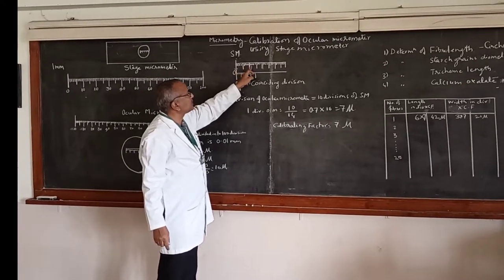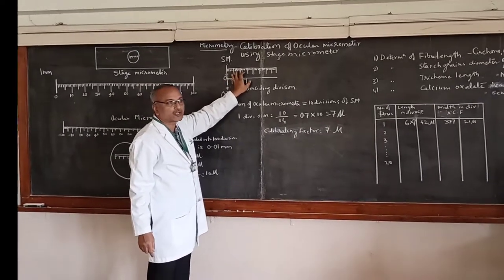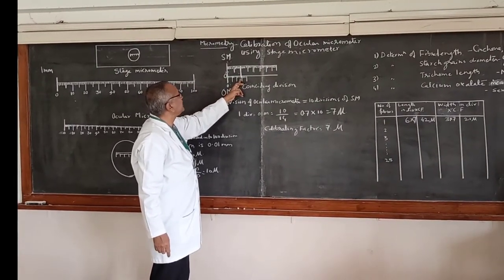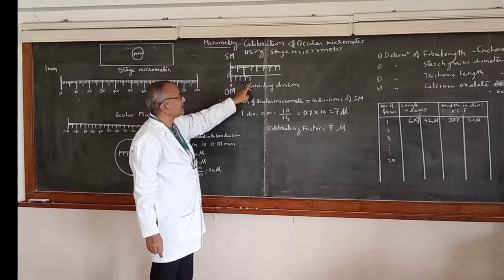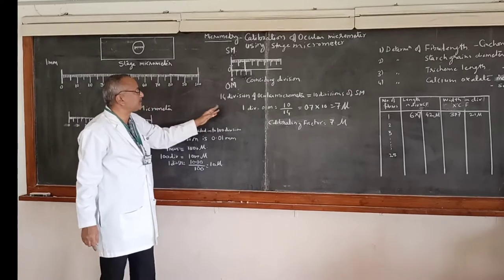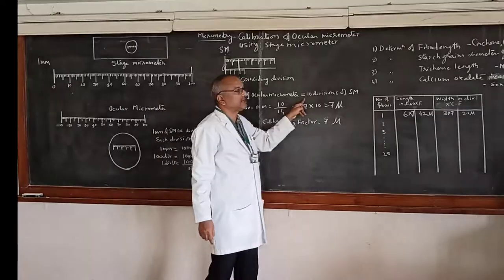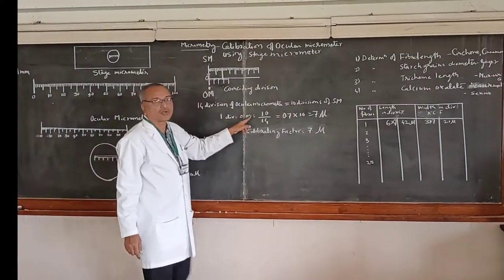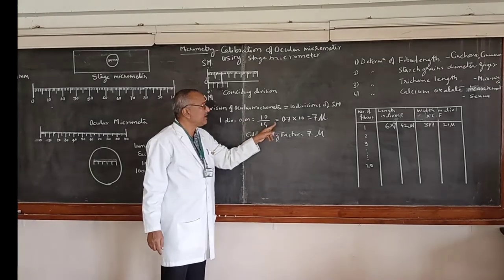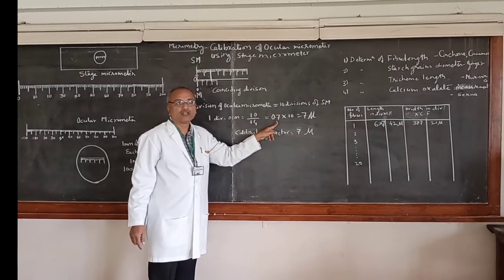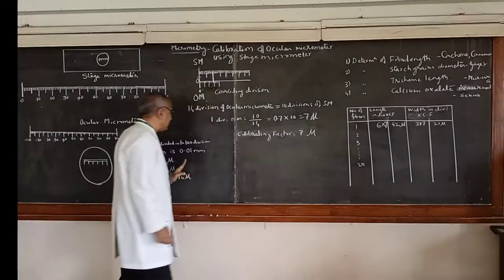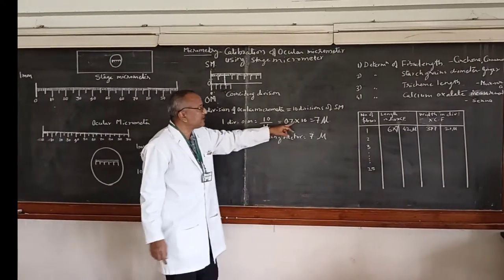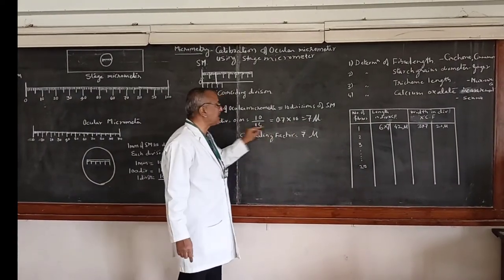We have identified the coinciding division of the stage micrometer, which aligns with the 14th division of the ocular micrometer. For calibration purposes: 14 divisions of the ocular micrometer equals 10 divisions of the stage micrometer. Therefore, 1 division of the ocular micrometer equals 10 divided by 14, which equals 0.714. This value, multiplied by 10, gives the calibration factor.